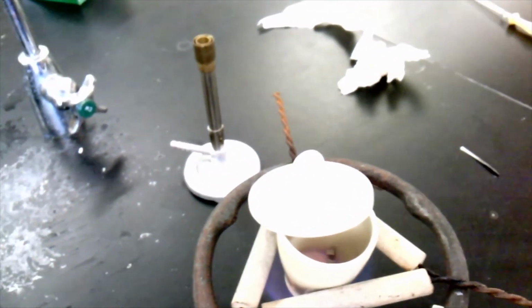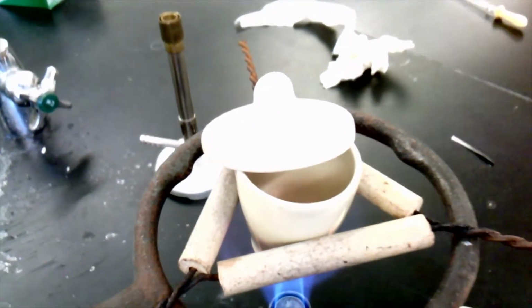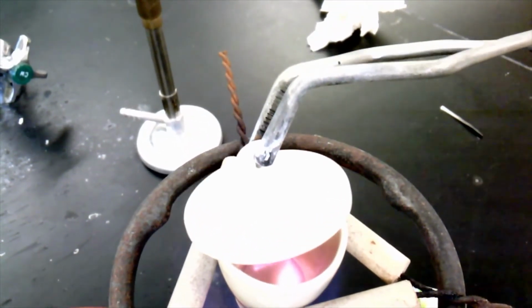We're going to end up sort of removing the lid occasionally and replacing it so that it will still be able to get enough air. Okay, now we just wait. And there we go, we have liftoff inside. So now it's really important that we cover it. Okay, we can definitely tell it's reacting.